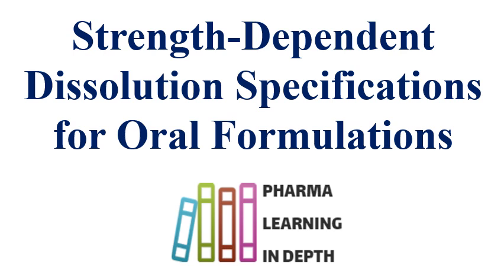Oral formulations are like tablets, capsules. These formulations may be formulated into immediate release, modified release, delayed release, prolonged release, and many other types. Also, the oral formulations include oral suspensions for which dissolution testing is performed.